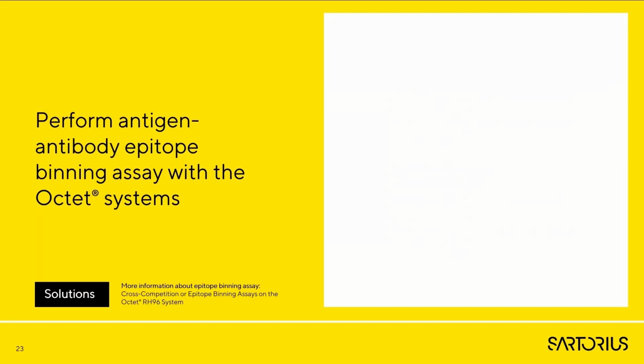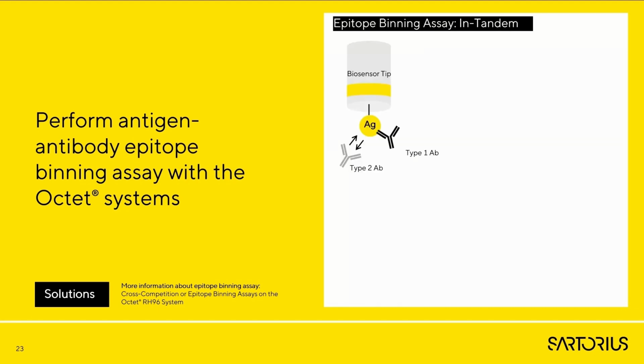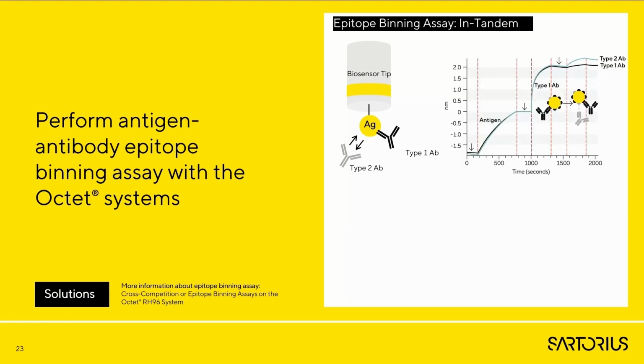To understand this behavior, we performed the antigen-antibody epitope binding in tandem assay. The antigens were immobilized on the biosensors. After reaching equilibrium, the biosensor was dipped into type 1 antibody solution, then type 2. A faster binding of antigen to the type 1 antibodies occurred, shown as a steep curve, but only a minimal interaction with type 2 antibodies, shown as a flat curve.